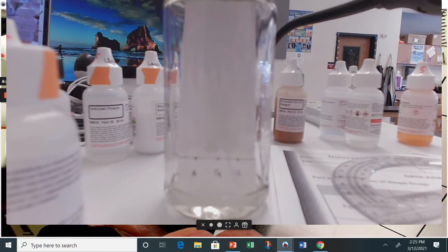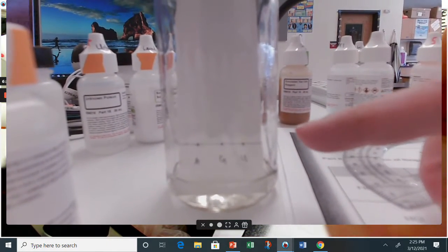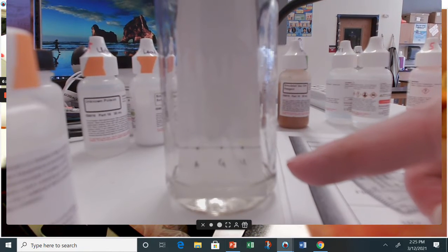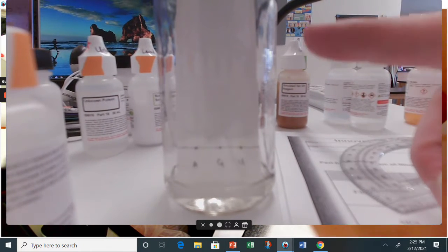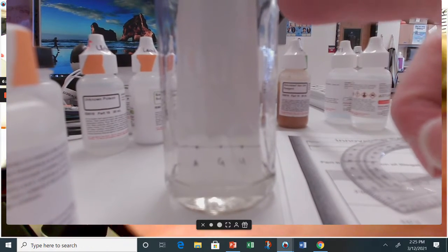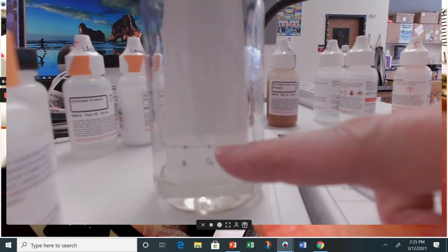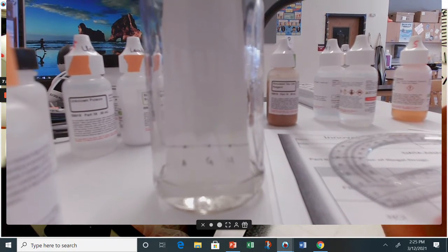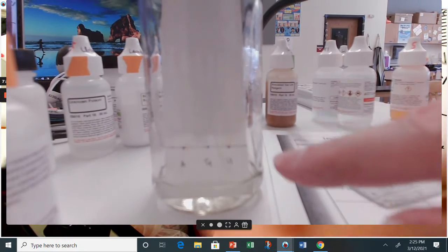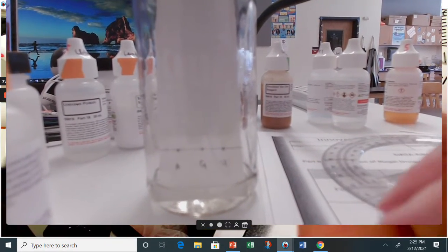So over time, the solvent travels up that piece of paper. The liquid travels up, and you can almost see the shading differential. It's much darker up here. It's lighter down there. That's because the solvent's traveling up. So like I said, I'm going to pause it once the solvent gets all the way up to the top. And this may not travel too well, guys. I can already see it's really not traveling in a nice straight line across the piece of paper. So the things that I dabbed are going to go off at a slant. Ideally, you want the solvent to travel up in a nice straight line.